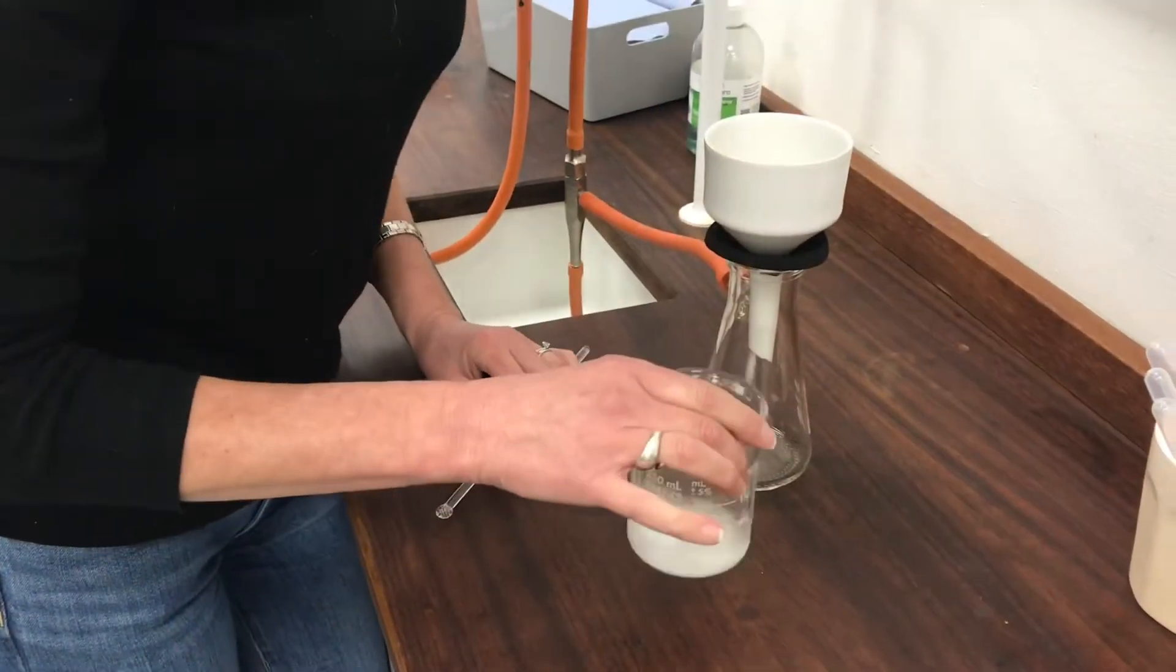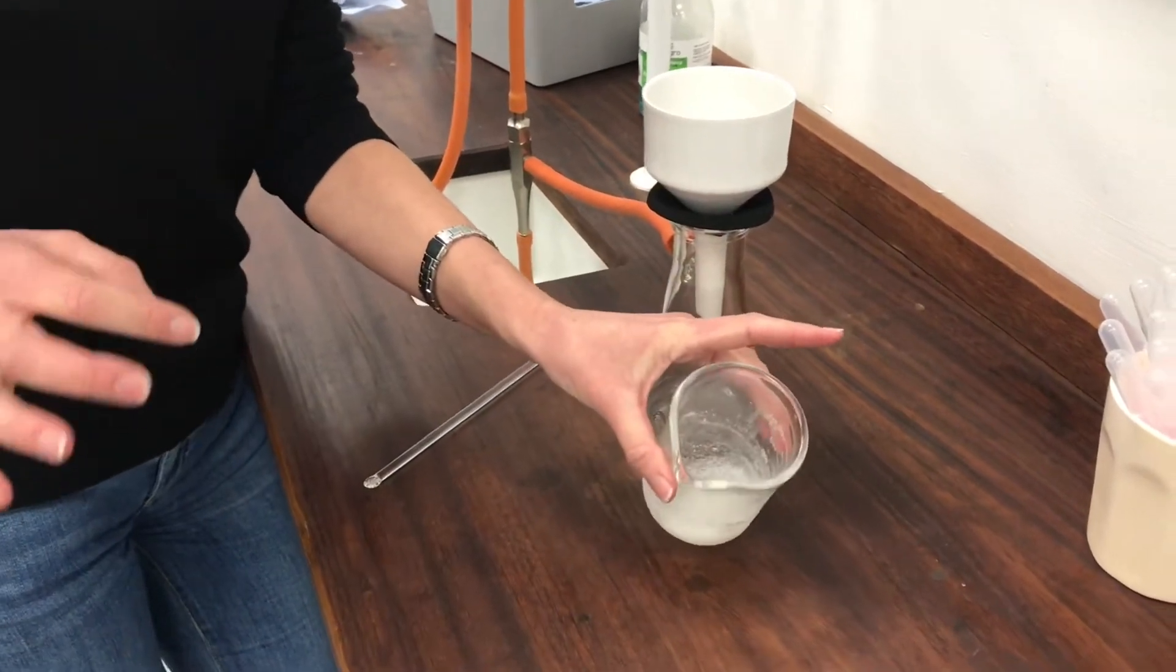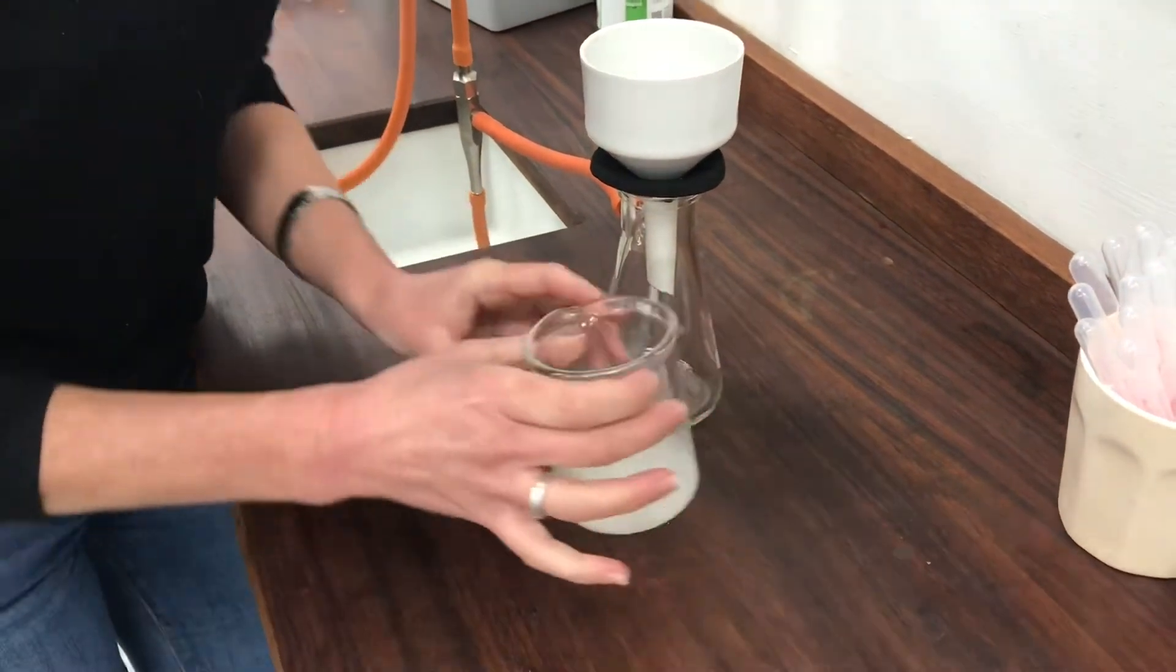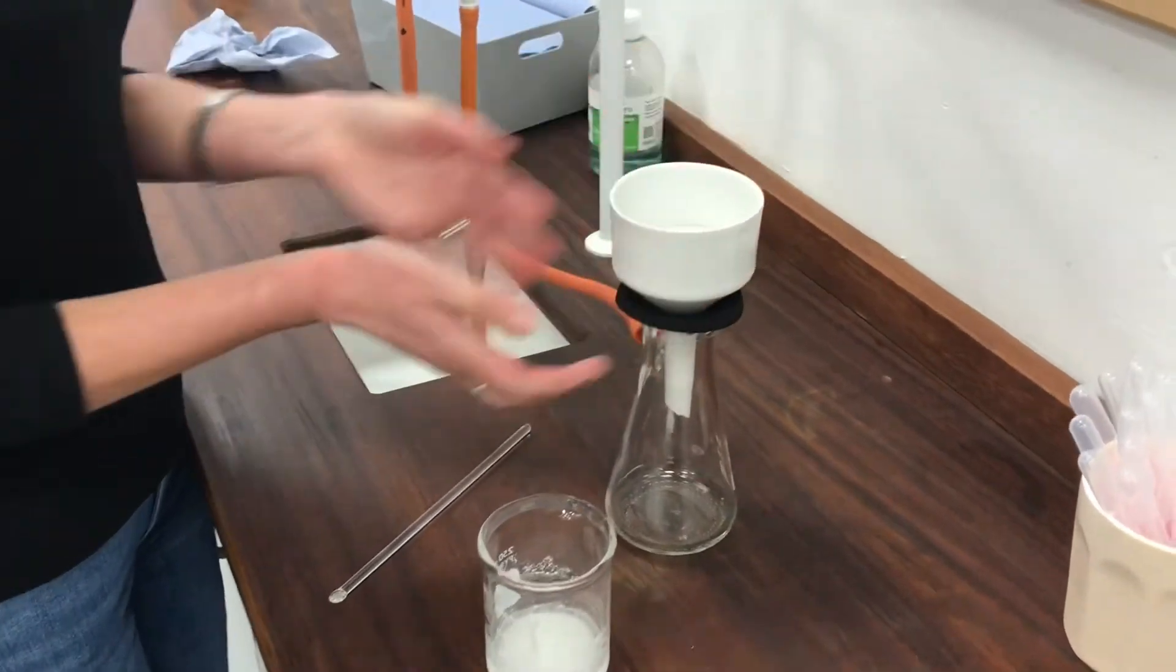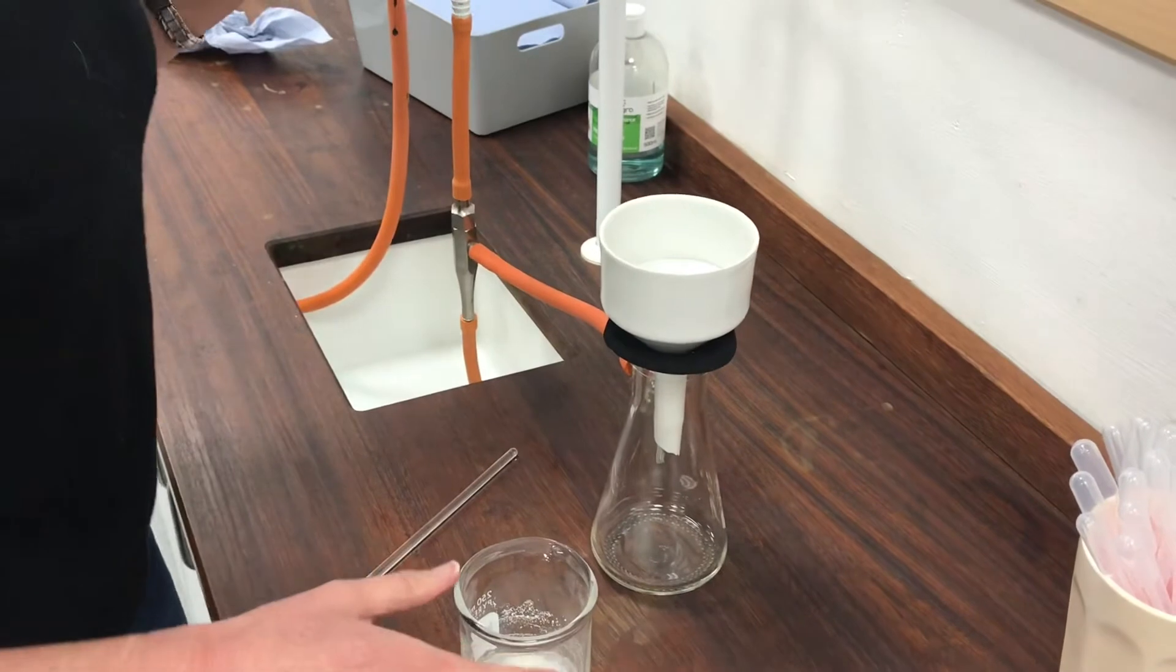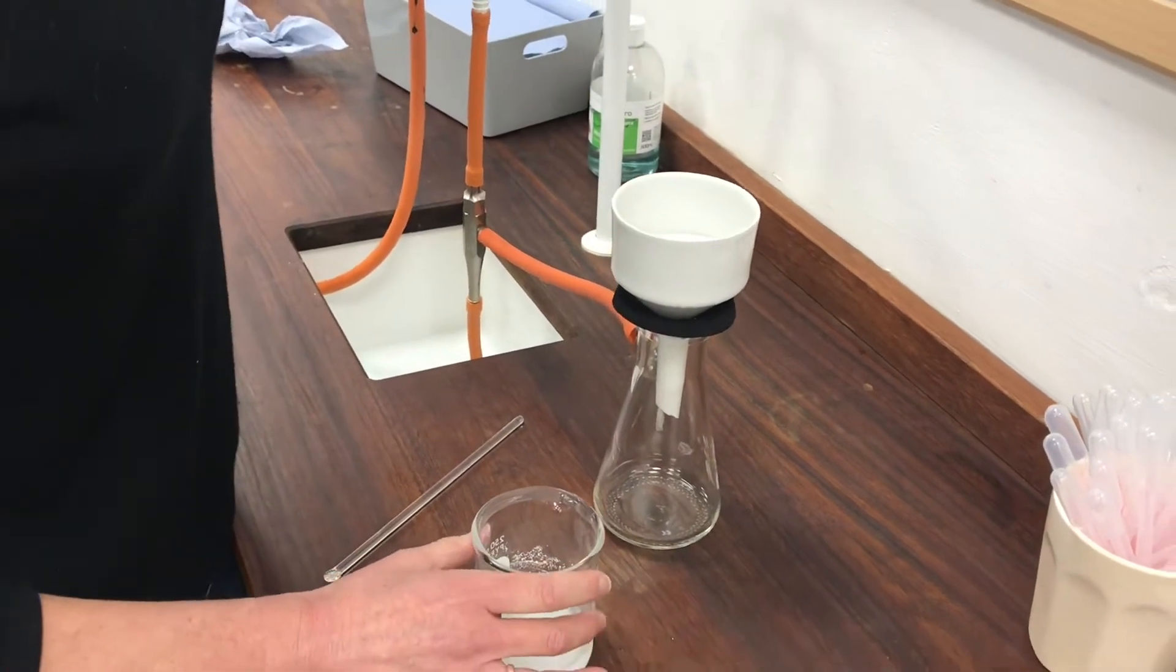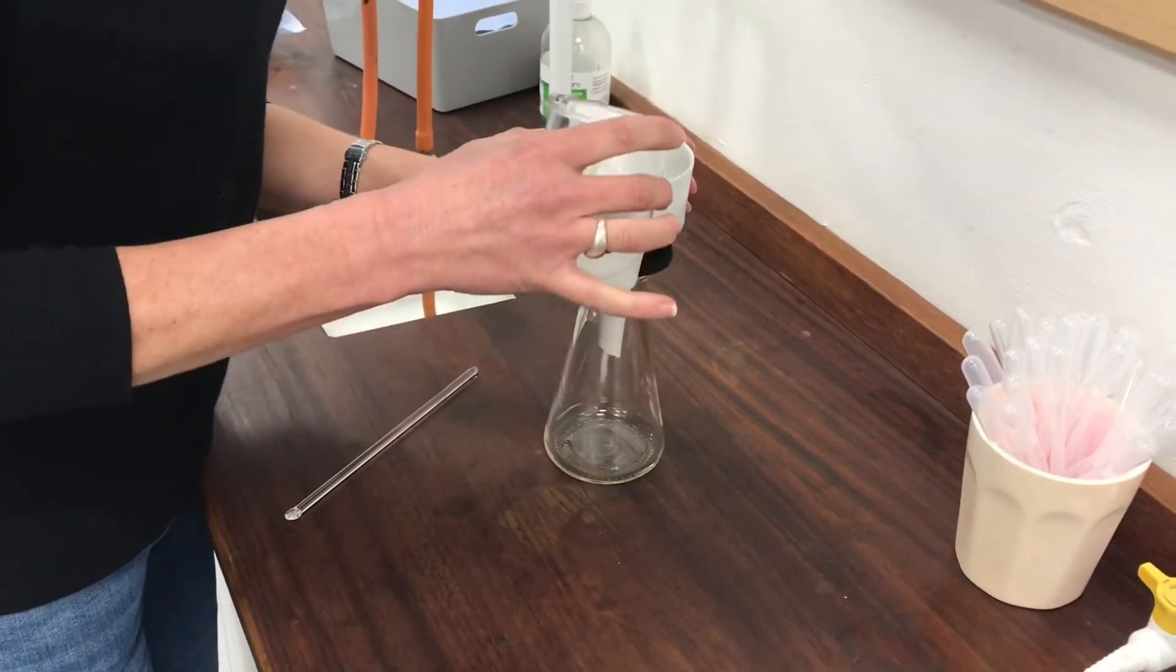So my ice has melted now, my crushed ice, and I've got all my solid product in there. So my first job is to filter this. And I'm going to filter it under reduced pressure. So that means using a Buchner funnel and the suction pump. So I'll turn the suction pump on and filter to extract my product.